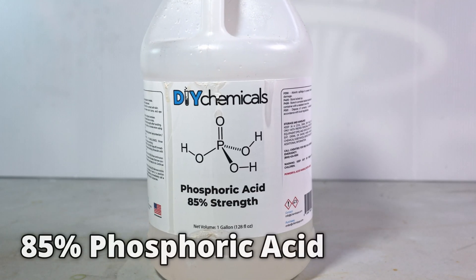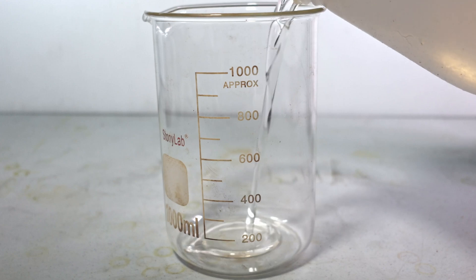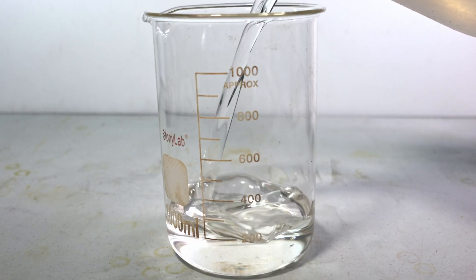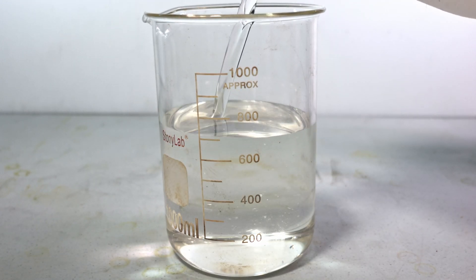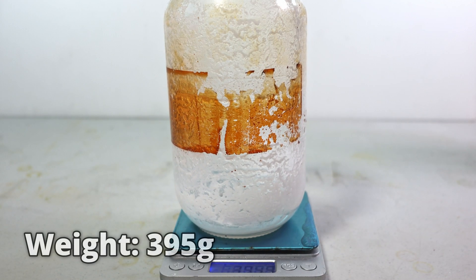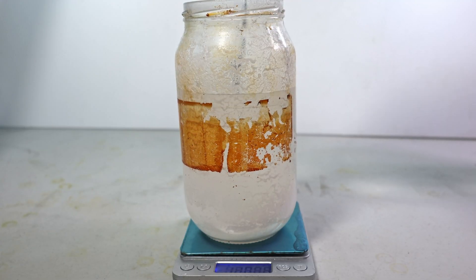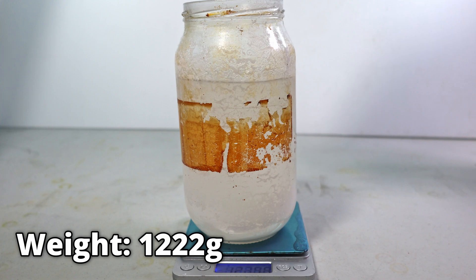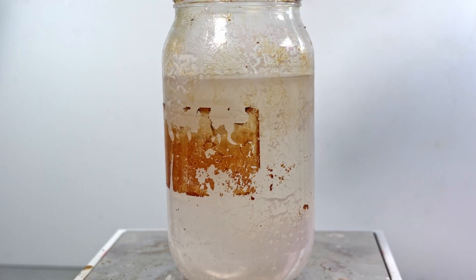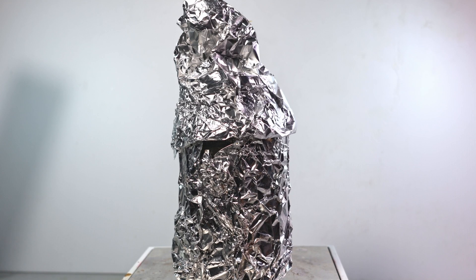The only materials you need are phosphoric acid. To make the polyphosphoric acid, I'm going to start with 750 milliliters of phosphoric acid. The next thing I'm going to do is weigh my crucible. Next, I'm going to weigh how much phosphoric acid I'll be using — the weight is right at 1222 grams. Then I'm going to place it on my hot plate, wrap it in heavy duty aluminum foil to insulate, and give it a big hood for further insulation and venting.